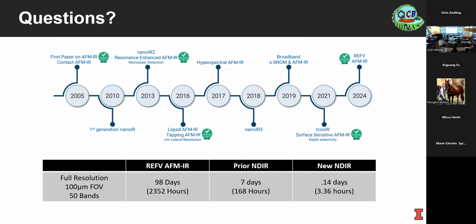Do you have a sense of the chemical sensitivity, just the ballpark of a ballpark, nanomolar, micromolar? What are we talking about? Molecules in the cell of a given species. Yeah, I don't have a sense of the molar sensitivity. I just know that the signal does come from the molecular species that exists within approximately a 20 nanometer volume underneath the tip. So you can probably extrapolate that out. Square or cube? How should I think of it? It's approximately a hemisphere, right under the tip. So a hemisphere of a radius of just tens of nanometers.